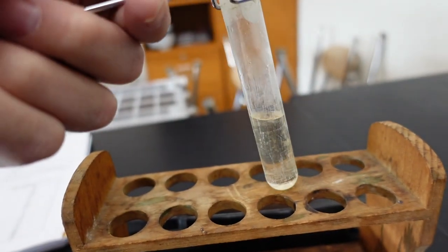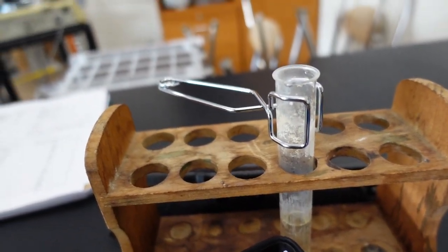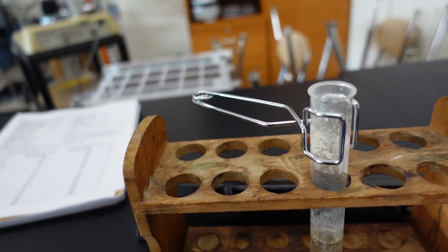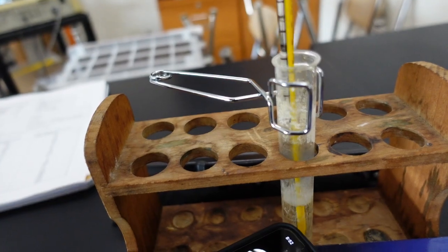So I'm going to take the test tube and place it in the rack, like so. Place the thermometer in so that you can read it.